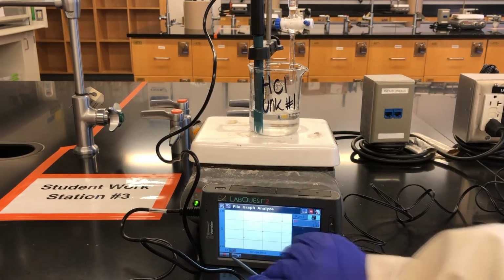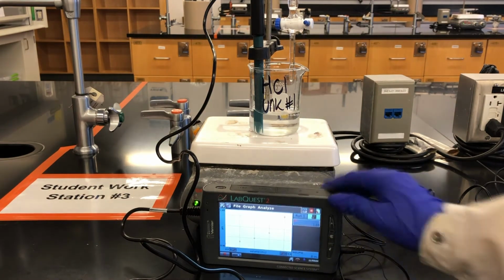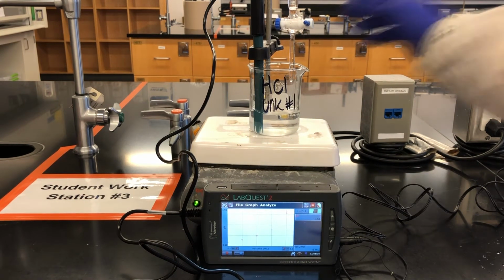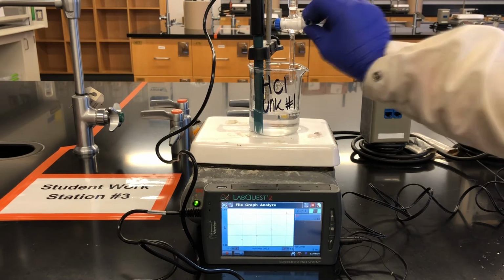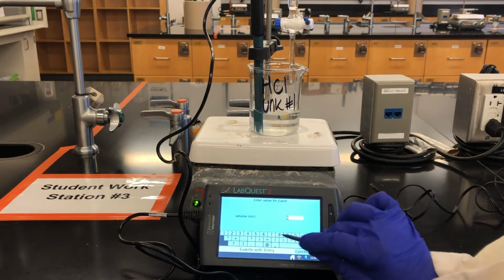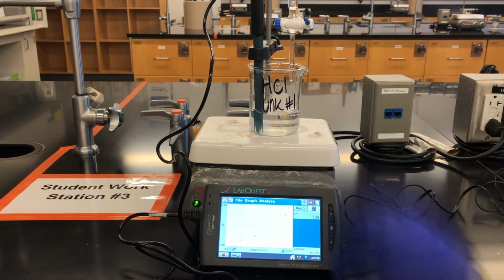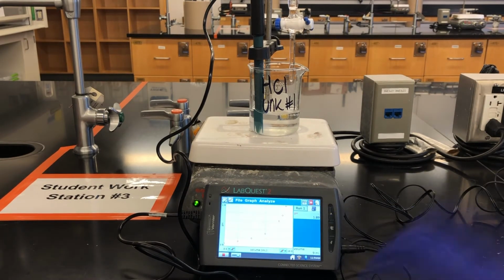As we approach the endpoint, we reduce the amount of titrant added between each data point from 2 milliliters to 0.5 milliliters, and then finally down to dropwise additions. We continue adding dropwise additions of titrant until the HCl solution turns pink and remains that color. This volume is the end point.